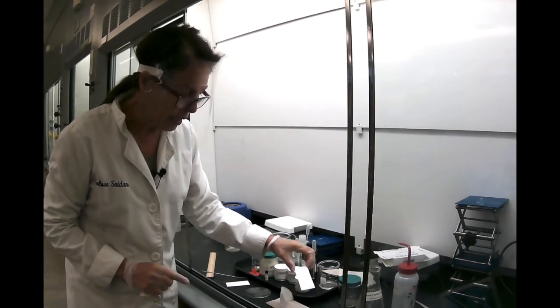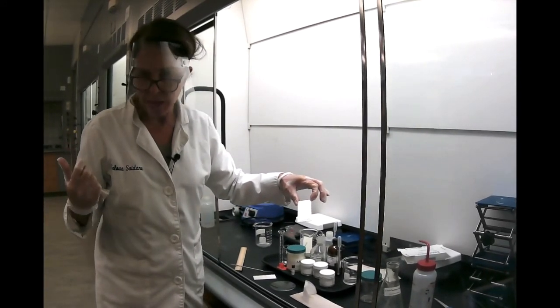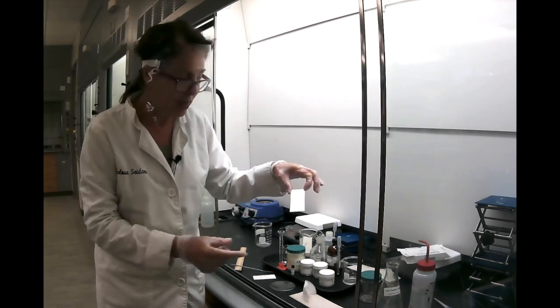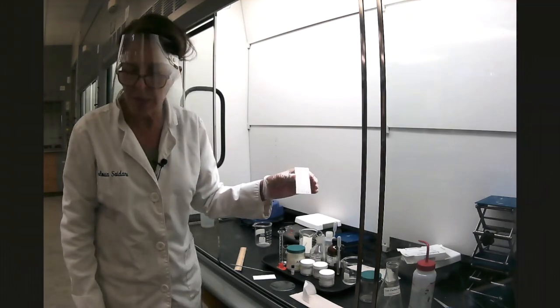Okay, now it looks like our plate is dry, so we're ready to see it under the UV light, because as you can see here, we don't have any way of gauging what the substances are.